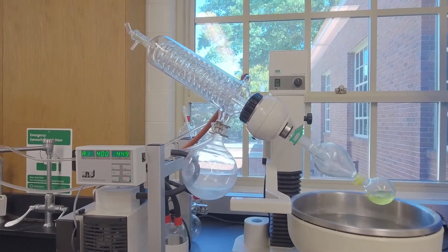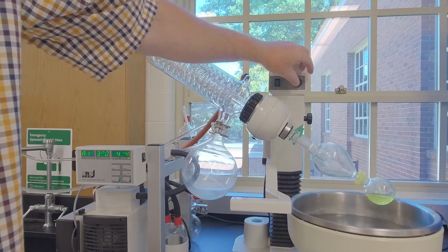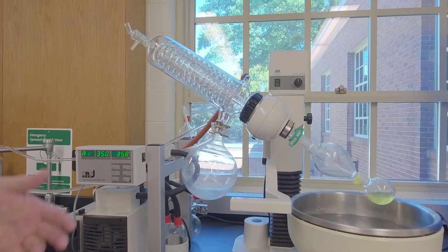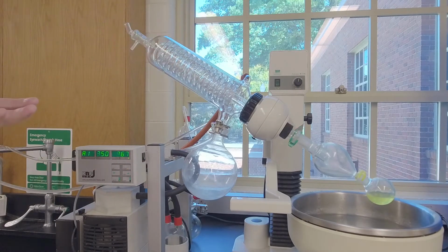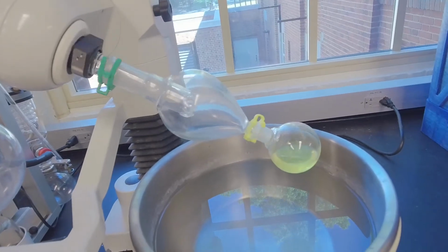All right. So now, what's going on? How does this help get rid of the ethyl acetate? So we've got a vacuum. What happens to the boiling point of a liquid under vacuum? Boiling point goes down, right? So by pulling a vacuum, I'm lowering the boiling point of the solvent. This is going to let me remove the solvent without heating it up to 70 degrees. And if you look at that, you'll see bubbles starting to form.